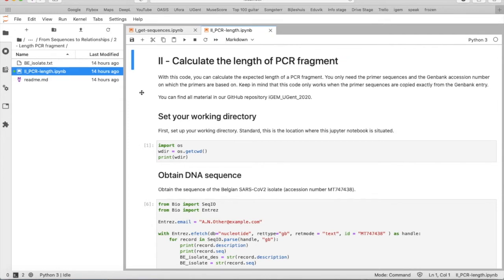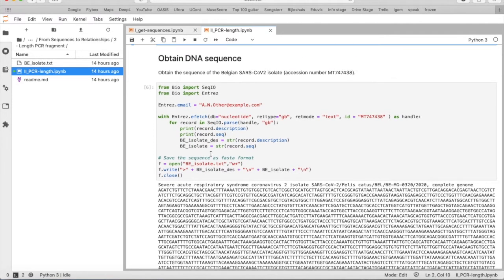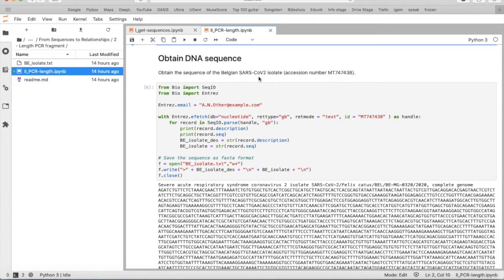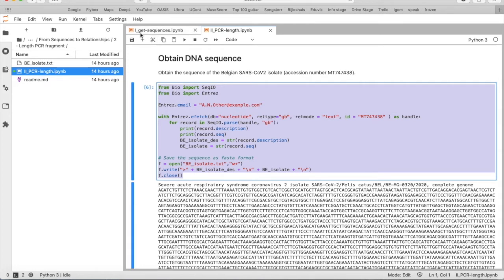So first of all, as in the first tutorial, we will set our working directory, as before, and then we will obtain the nucleotide sequence of a Belgian SARS-CoV-2 isolate. And this one we already discussed in the first video, so it's just a copy-paste of the code as in the first file.